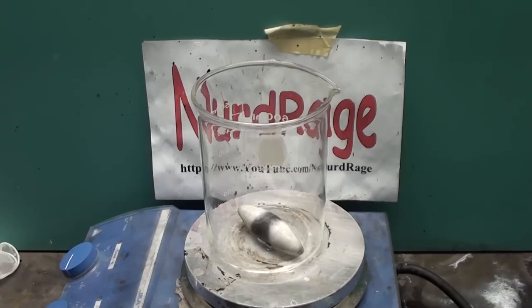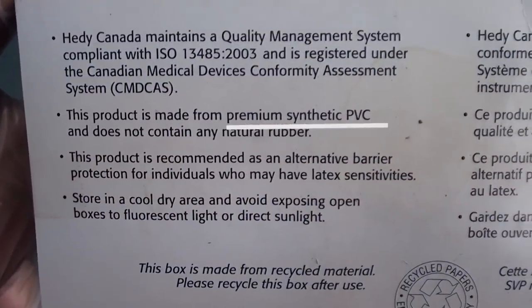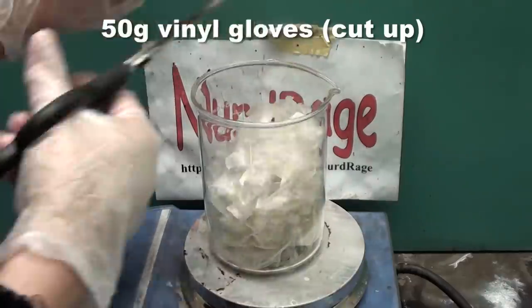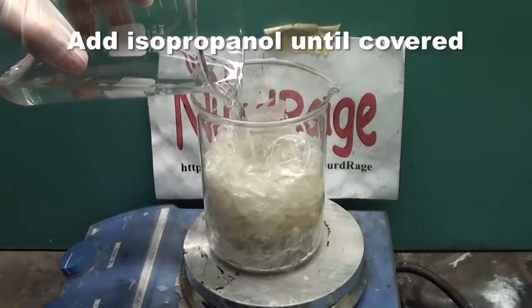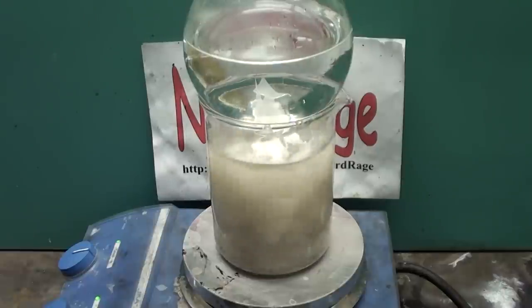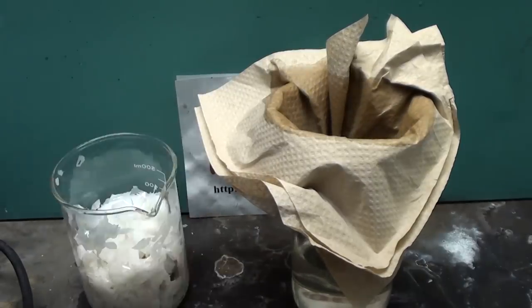First we need to get diethylhexyl phthalate. This is actually found in vinyl gloves, which are usually sold in pharmacies. Look for the ones that say they are made with PVC. PVC, or polyvinyl chloride, is a very rigid polymer, so to make the gloves flexible, diethylhexyl phthalate is added. To extract it, we get 50g worth of gloves and cut them up. Then we add isopropanol, also known as rubbing alcohol, to completely cover the gloves and boil the mixture. I've put a round bottom flask of cold water on top to condense the alcohol vapors and reduce losses. As it boils, the alcohol leaches out the diethylhexyl phthalate. This should be done for about an hour or so. After the mixture is cool, filter it and retain the alcohol solution of diethylhexyl phthalate.